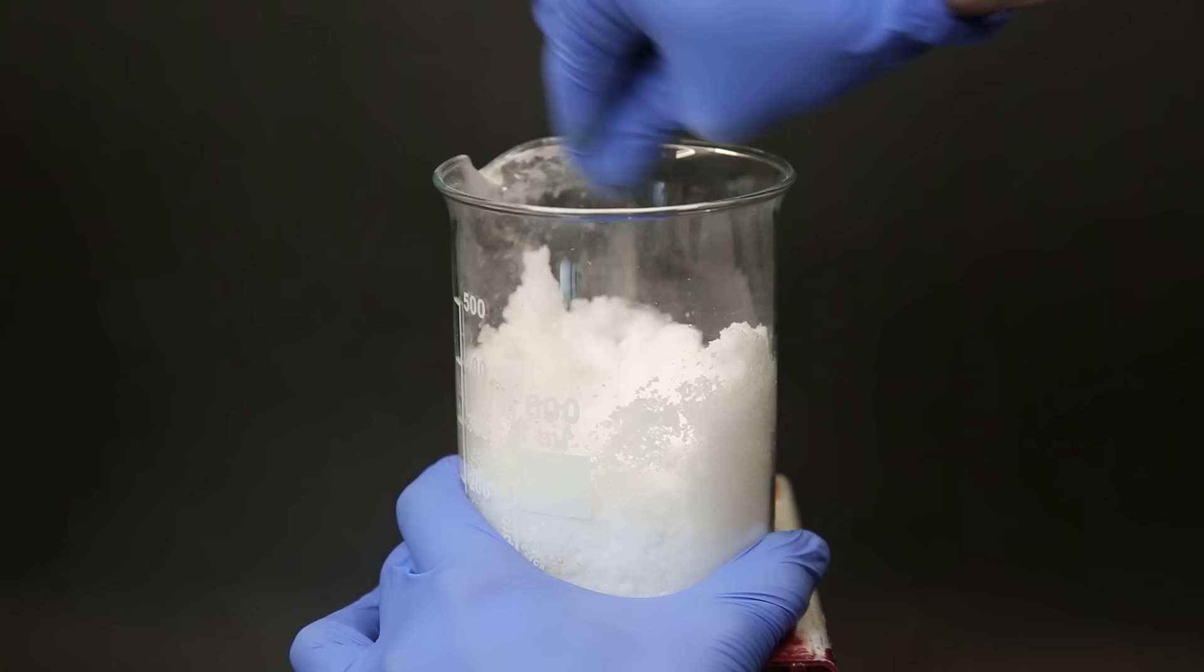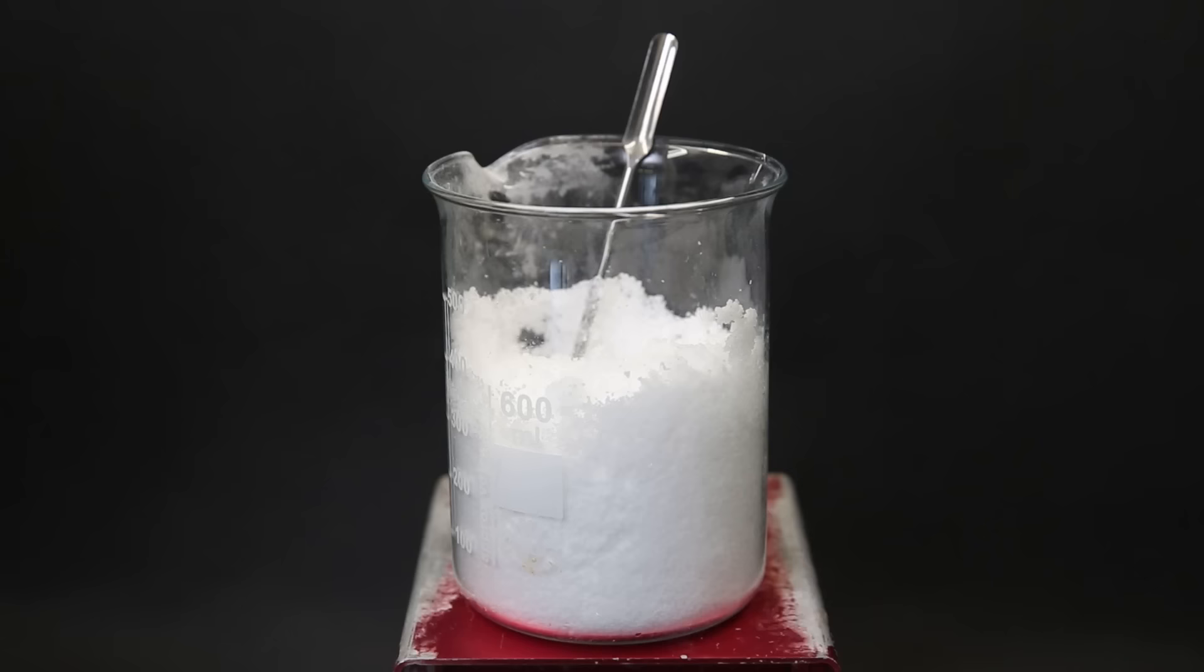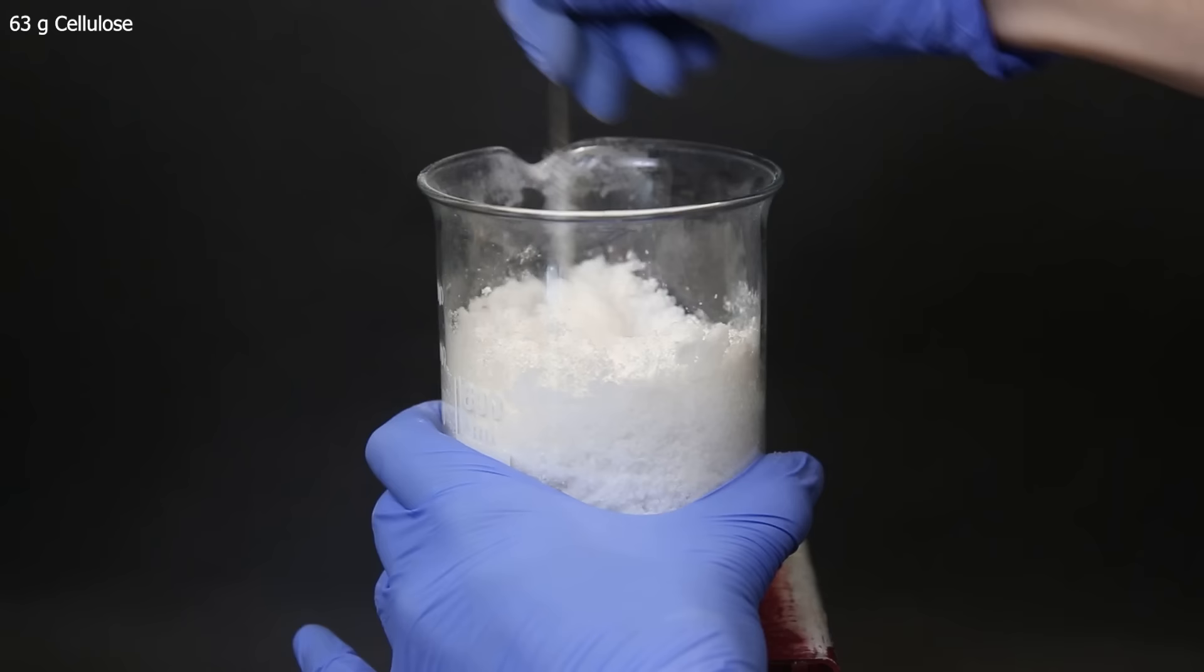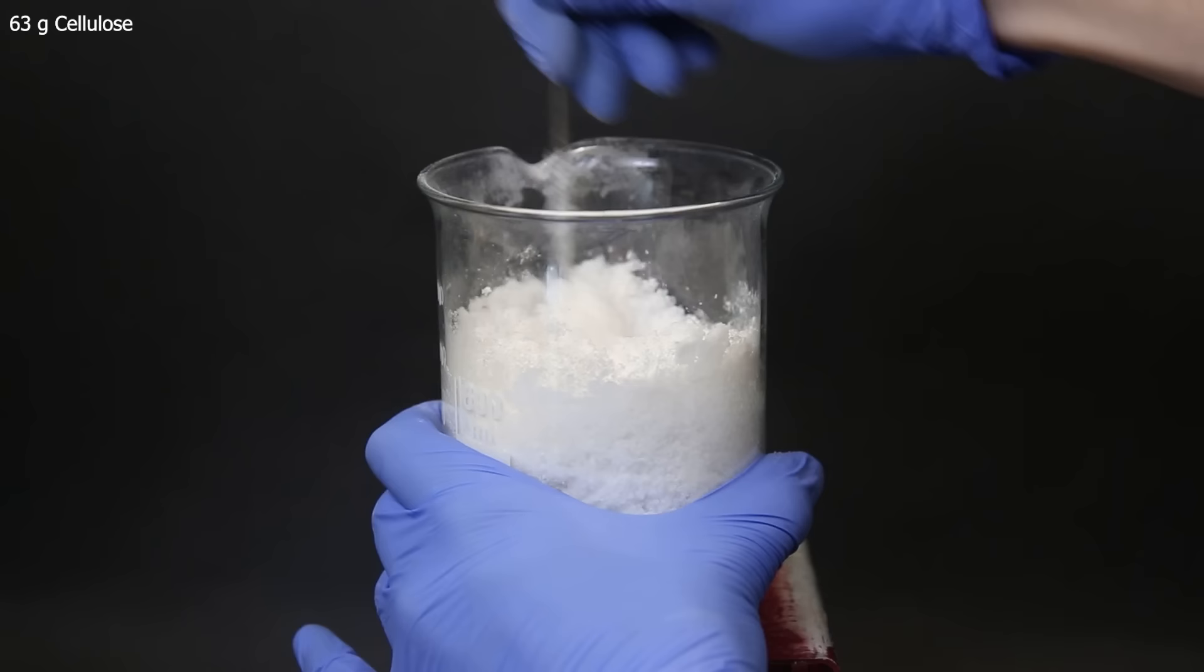When it has been mixed, I leave it for a while so that all of the methanol evaporates. And then I add 63g of cellulose powder. I add it in portions and mix it around so that all of the cellulose is spread evenly.